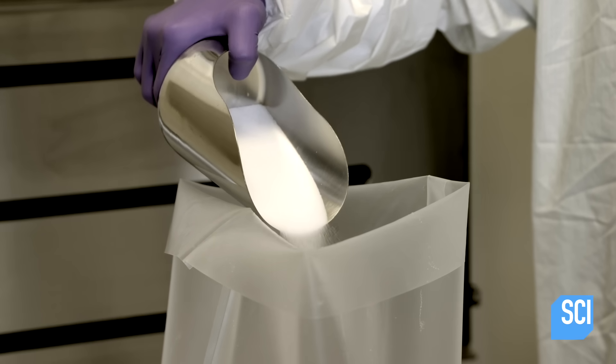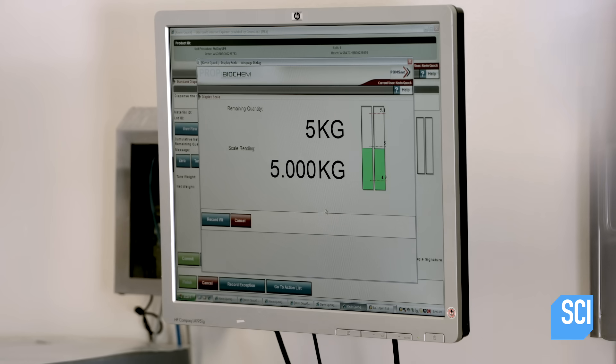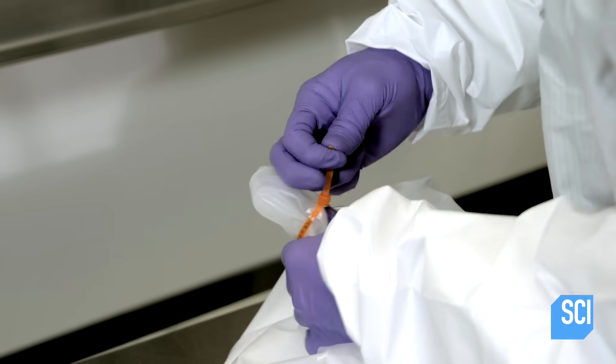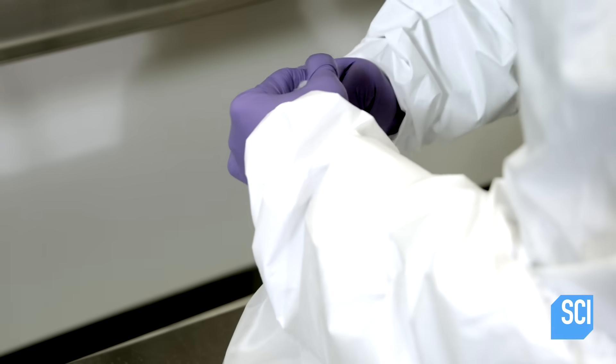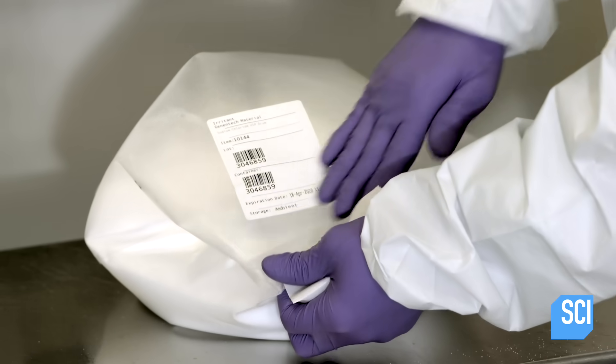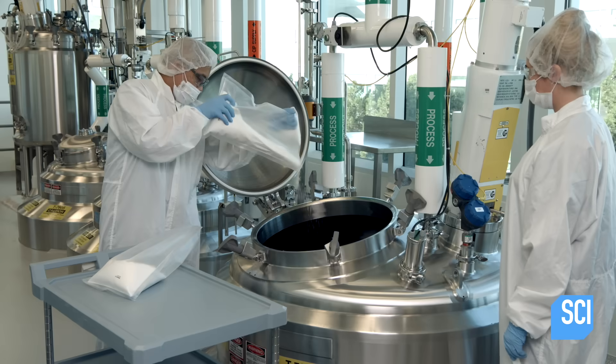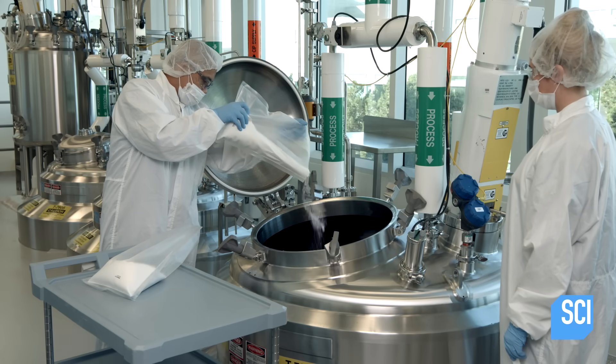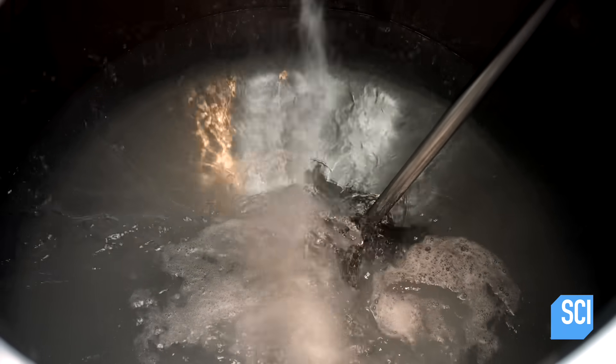He labels the bag and records the information separately, as required by government regulations. He adds the ingredients to purified water in a mixing tank.